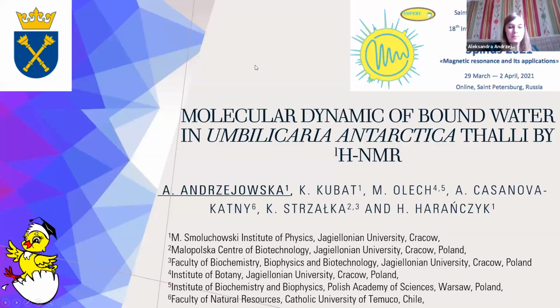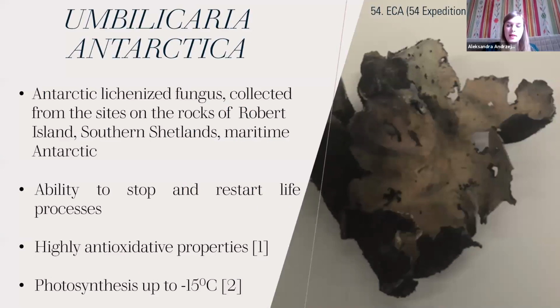Yes, thank you. My name is Aleksandra Andrzejowska, and I am an undergraduate student of Professor Hubert Harańczyk from Jagiellonian University, and I am going to present my research of molecular dynamics of bound water in Umbilicaria antarctica thallus by proton nuclear magnetic resonance. Umbilicaria antarctica is an Antarctic lichen.